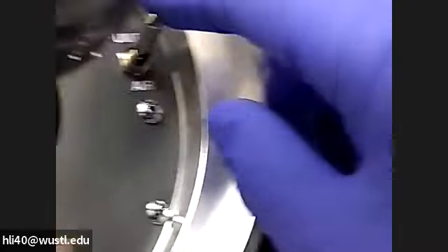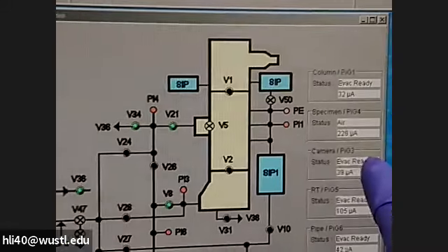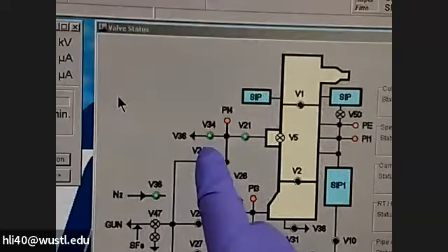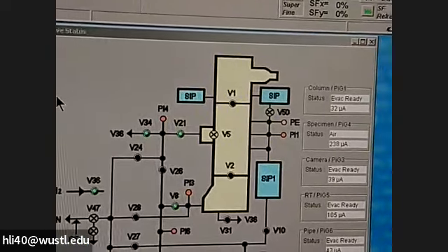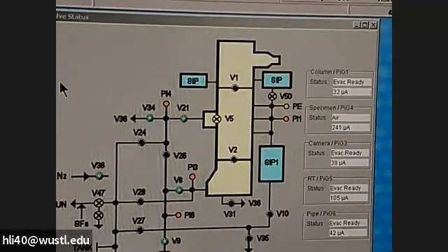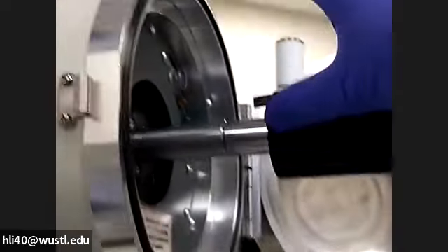We will change this switch from pump to L. So we just patiently wait. You will see here on the software the specimen reading will increase. When it's close to 240, the V34 will turn from green to black. Patient and wait. And now it's up, which means it's ready for you to pull out the holder. So the next step, you just simply pull straight.